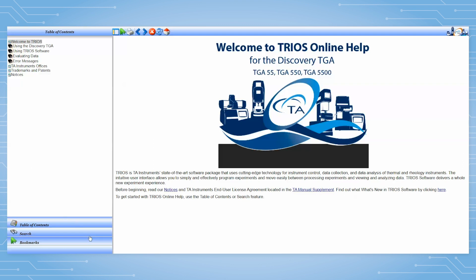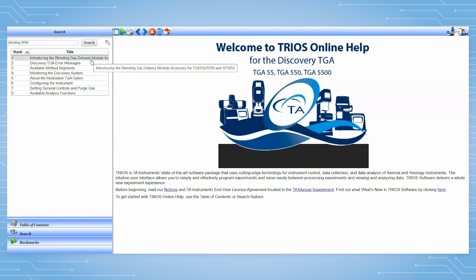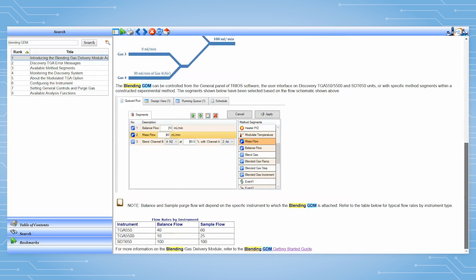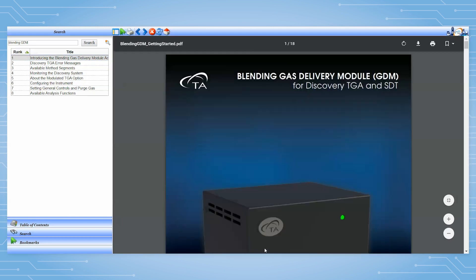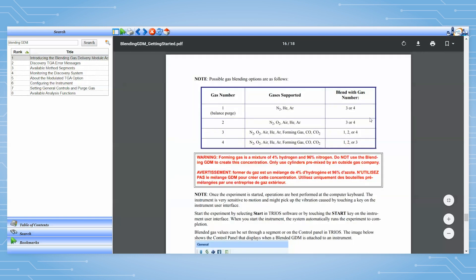To set up a test using the Blending GDM, make sure the balance and mass flow rates correspond to the recommended ones for your instrument. Please consult the TRIO help and search for Blending GDM to see the recommended flow rates by instrument type. Click on Blending GDM Getting Started to see the possible gas blending options for each gas port.